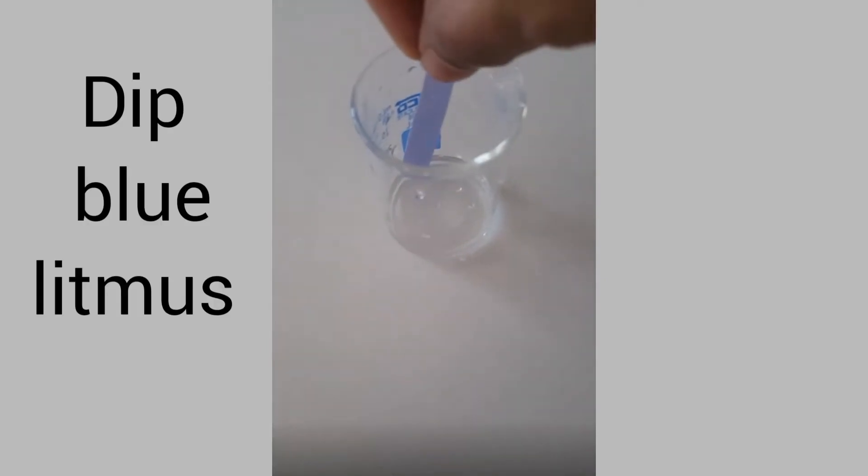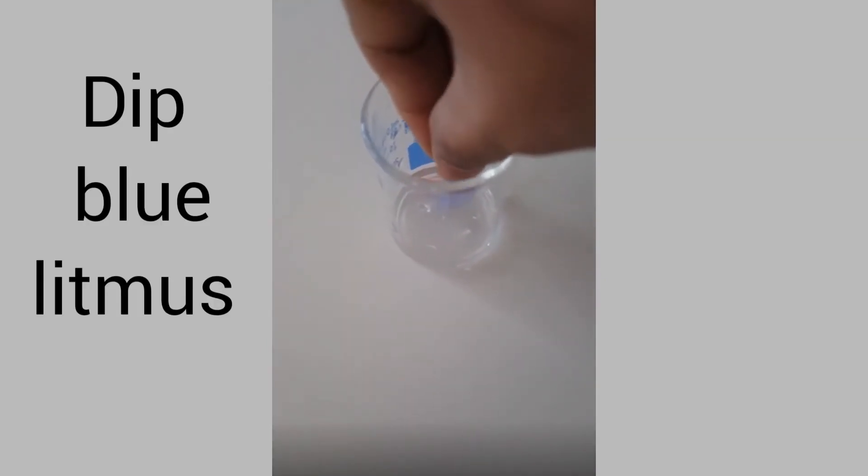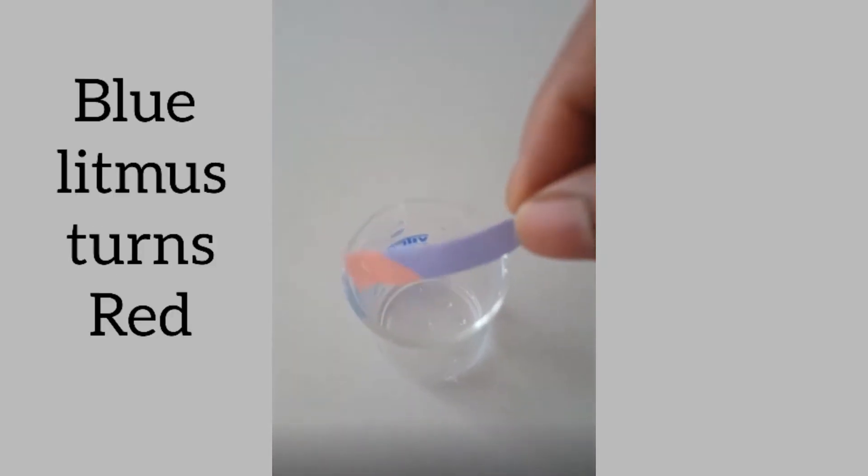Now, I am going to take blue litmus paper to do a test with the first solution. I am going to dip into the first solution now. You can observe. Wow. You can see the blue litmus paper has changed to red in color.